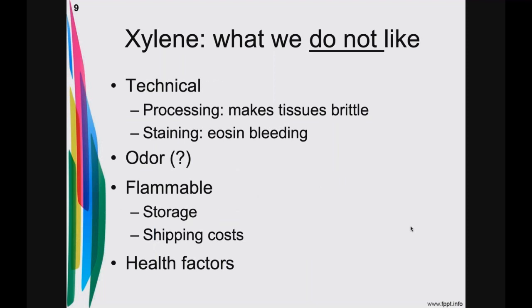Now, what we do not like about xylene is it is known that the longer the tissue sits in xylene, the tissues become dry and brittle. All right, we'll know about that soon. Xylene also is the cause of eosin bleeding off of our stained slides. So those are two technical things that make xylene a disadvantage. Its odor in histology, we're quite accustomed to the odor of it, so we may not think it's a horrible smell.